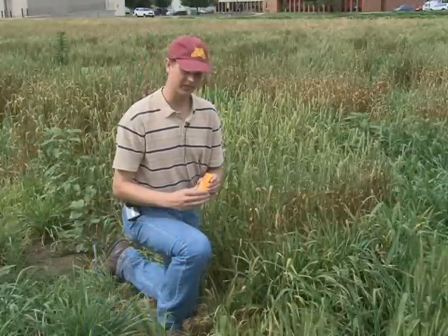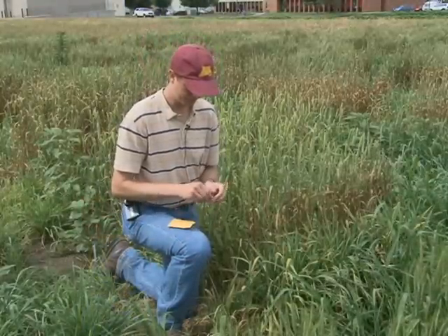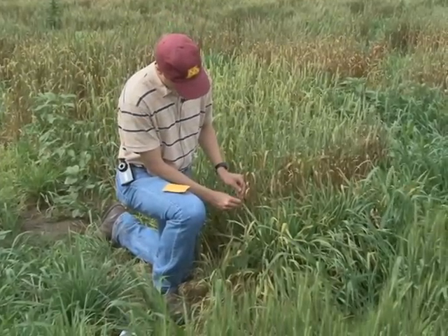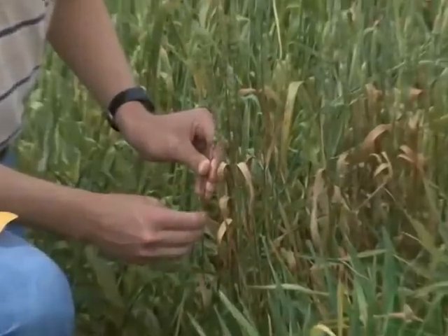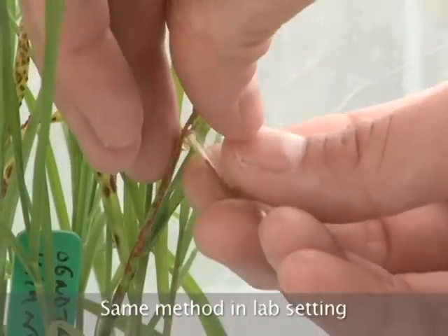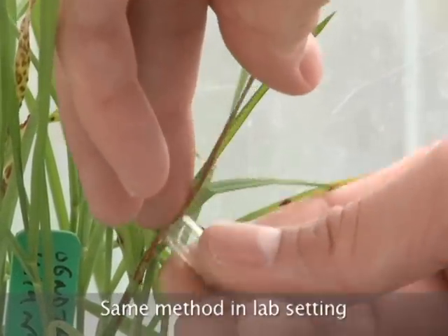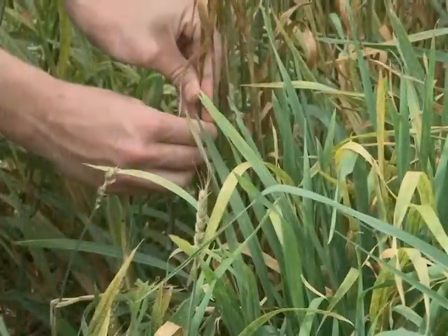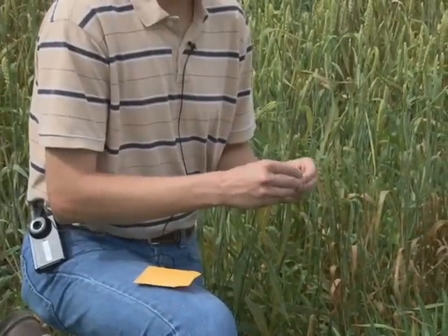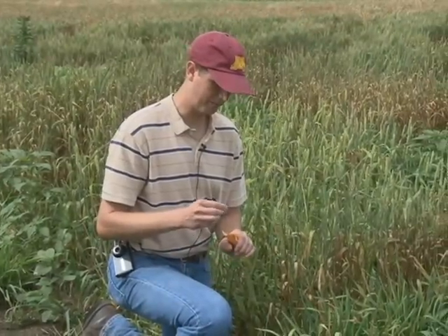In collecting stem rust into capsules, you can simply take a capsule, open the gelatin capsule up, and scrape the stems that are infected with rust with the gelatin capsule. The stem rust spores will fall off of the stem and land inside of the gelatin capsule. You can then close the capsule and take it back to your greenhouse or lab.